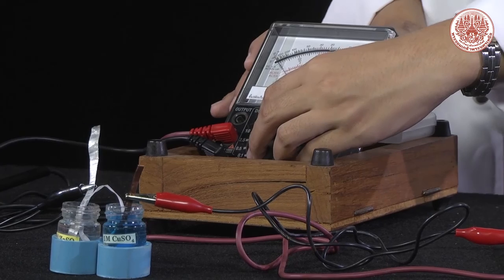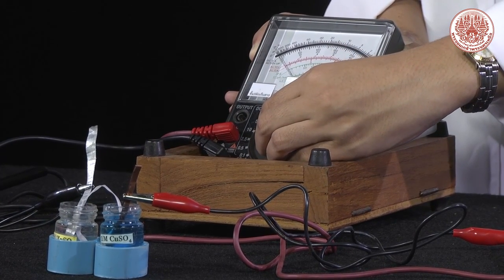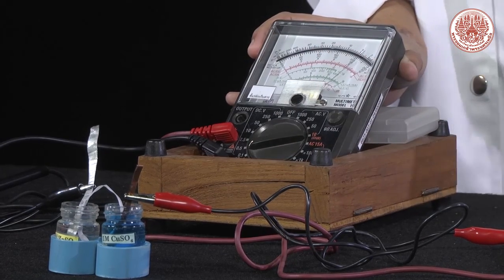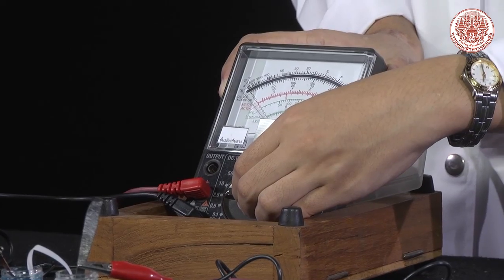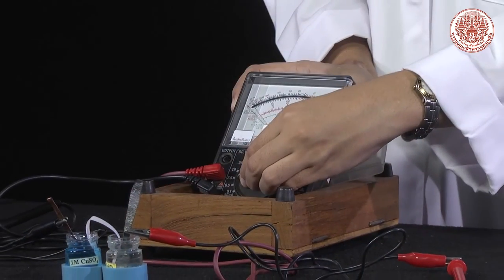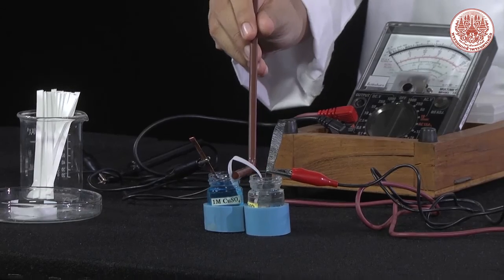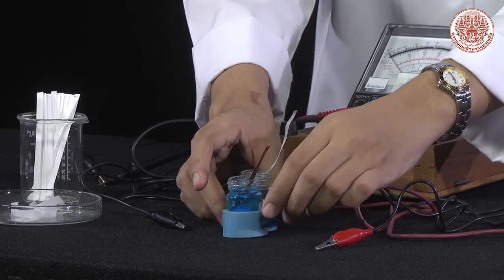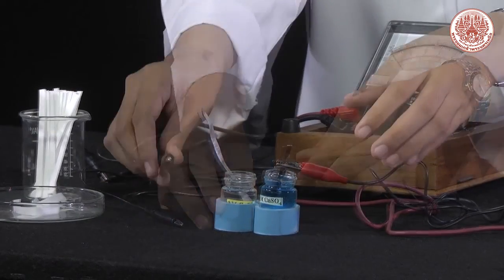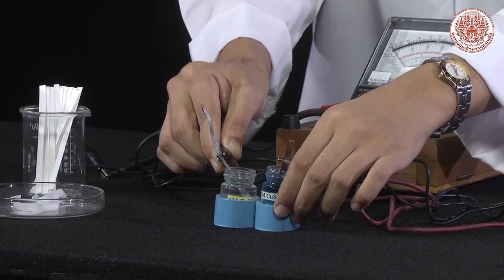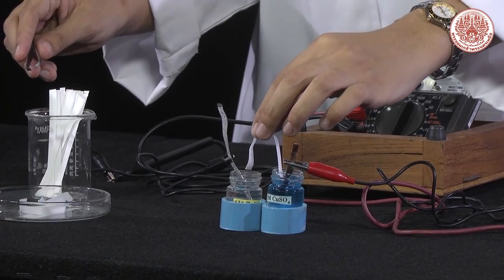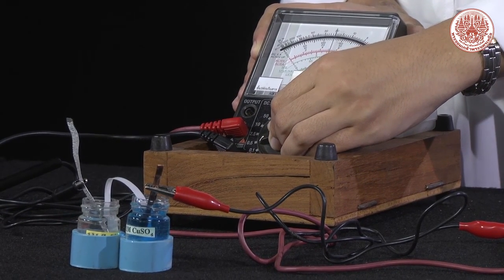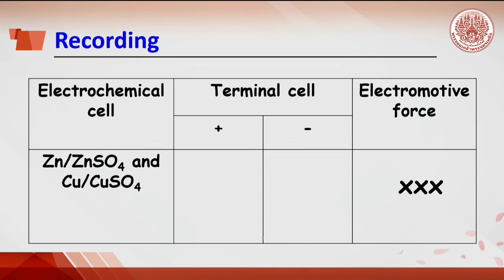Turn the selector knob from 1000 down step by step until the meter scale moves to the right about half of the full scale. Record the voltage according to the selector knob. If a negative voltage is displayed, switch the terminals by turning off the multimeter, discarding the salt bridge, and disconnecting the electrodes. Switch the solution connections, then reconnect the electrodes. Place the salt bridge across the two half cells. Start turning the selector knob until voltage can be read. Note that not only voltage is recorded, but electrode terminals are also recorded.